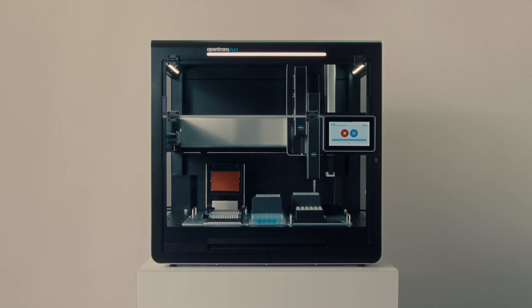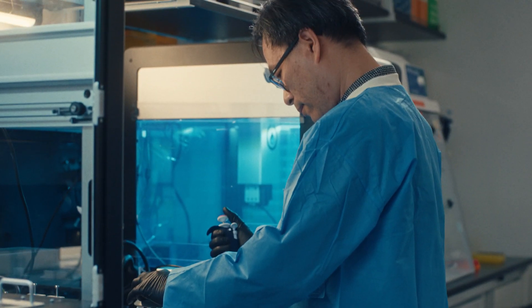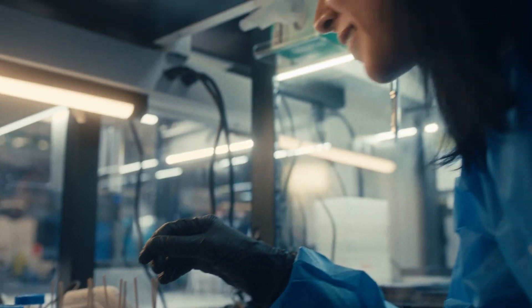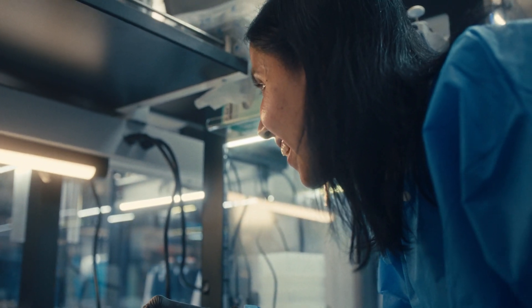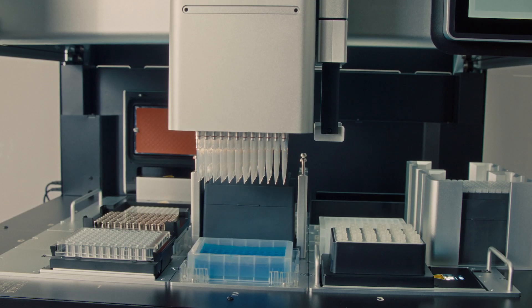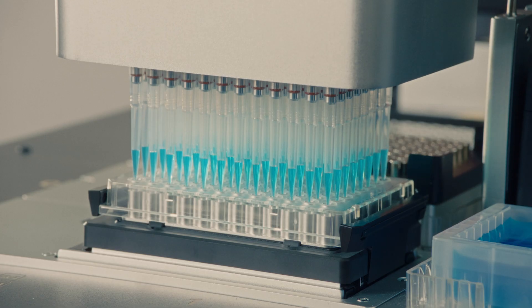We want automation to be accessible and we care so deeply here at Opentrons about accessibility because there's talent and work to be done, and research that needs to be carried out reliably and consistently, and everyone should have access to that. You shouldn't have to fit your experiments to antiquated automation systems — you should have the freedom to execute your lab work the way you want.